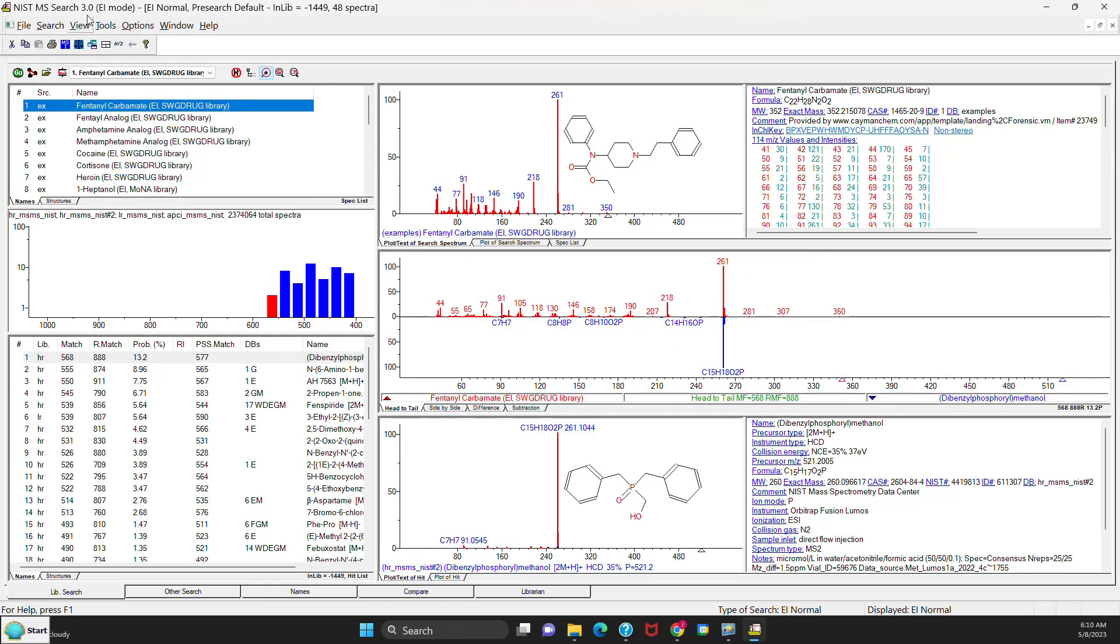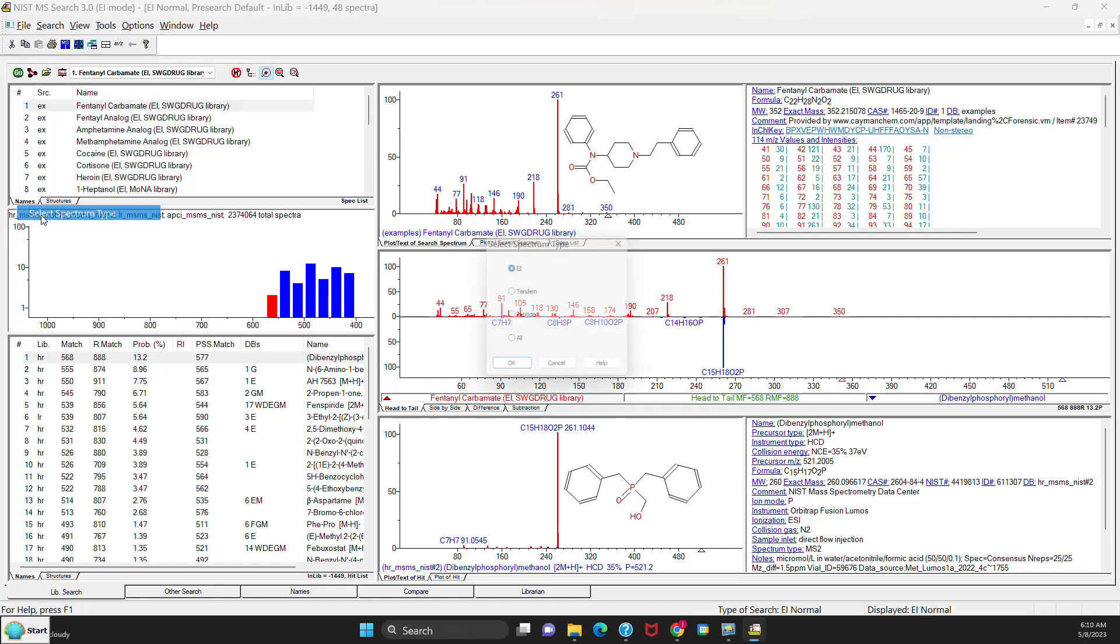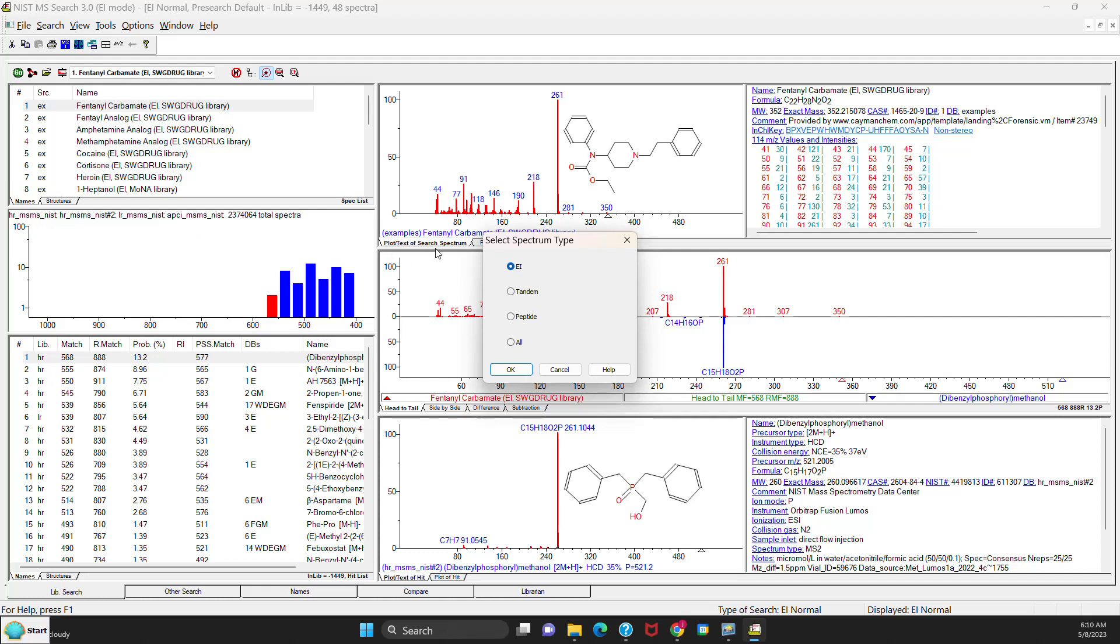I now have opened the version 3 software. The first change you'll see, if you go to File, you'll see there's another option here called Select Spectrum Type. Let's open it, and now you'll see that you can tell the software whether you'll be doing EI or Tandem or All. So EI would only show the options that are found for EI, the Tandem would show the ones only shown for Tandem, and All would show both the EI and the Tandem in one menu. So let's simplify the menu for doing EI by selecting that option and saying OK.